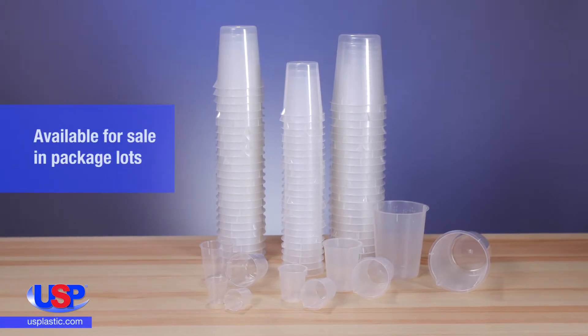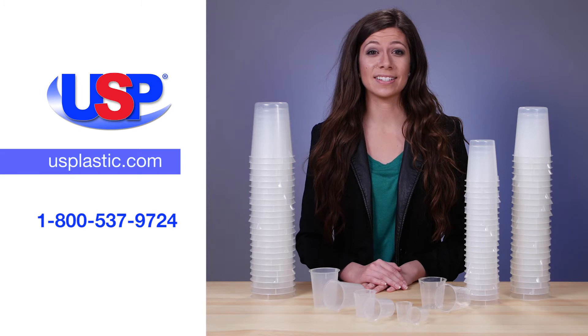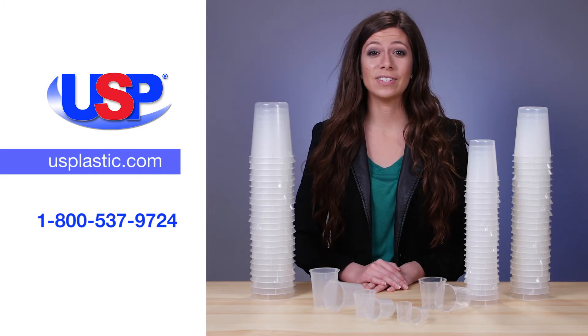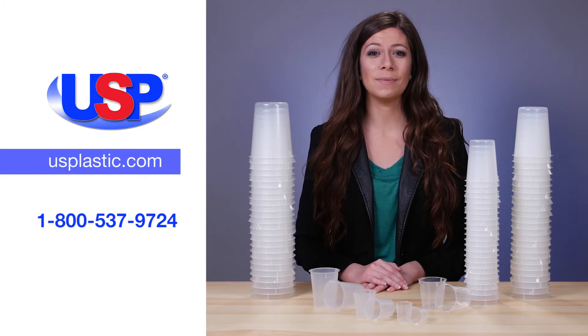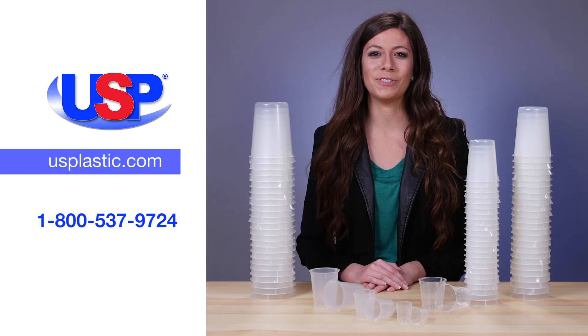The beakers are available for sale in package lots. For more information on our beakers, as well as our extensive line of quality labware, visit us online at usplastic.com or call us at 1-800-537-9724.